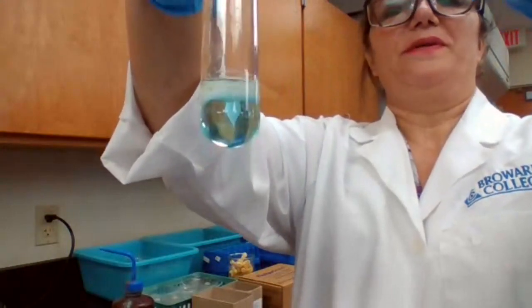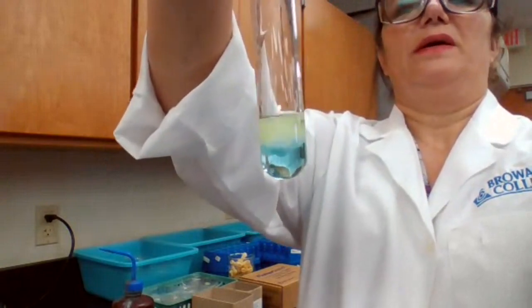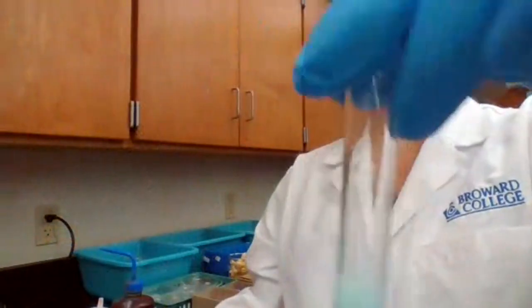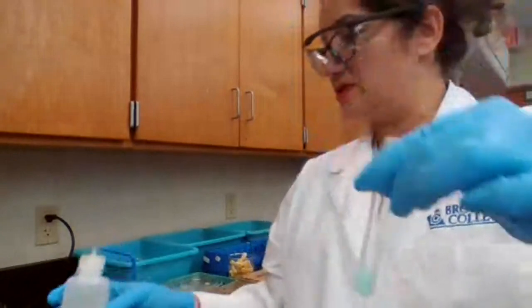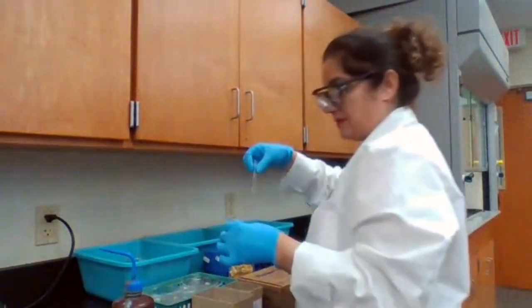See, a white precipitate is forming. 3 and 4 drops. So I mix it well. Now I have a white precipitate mixed with an aqueous solution. It's not all solid. Don't expect the whole thing to change to solid, because it's not going to change to solid.